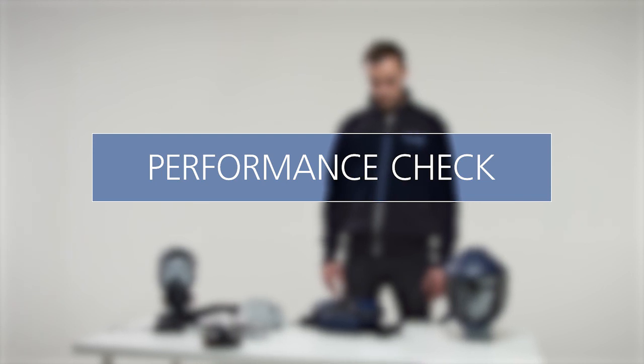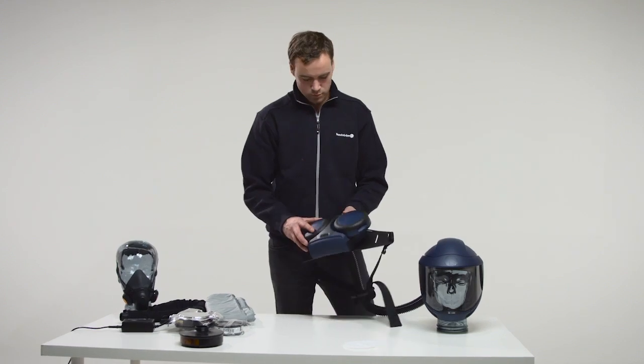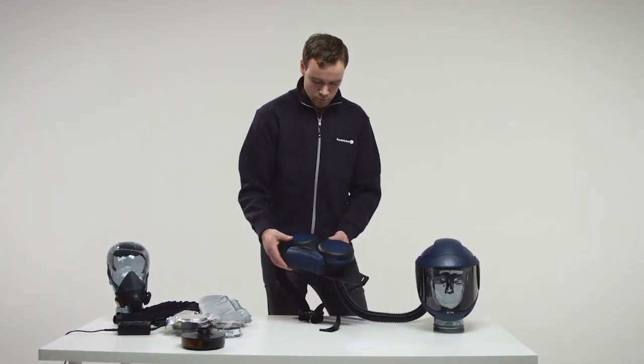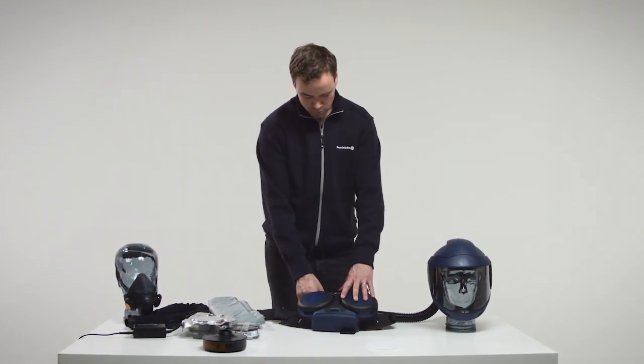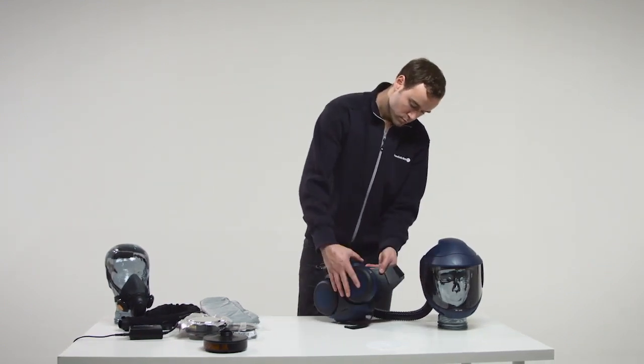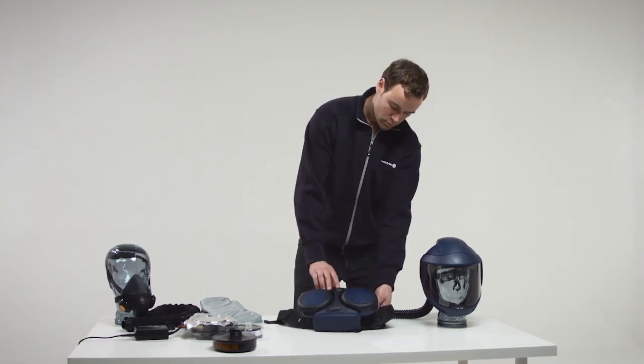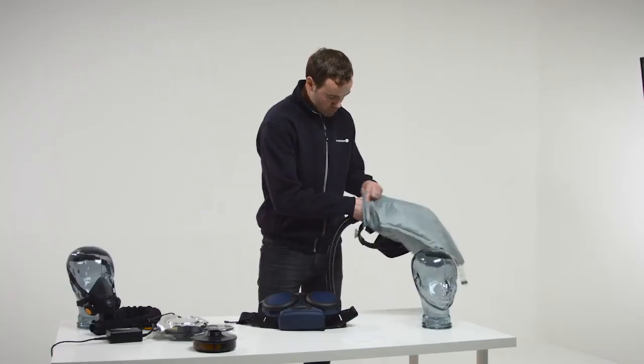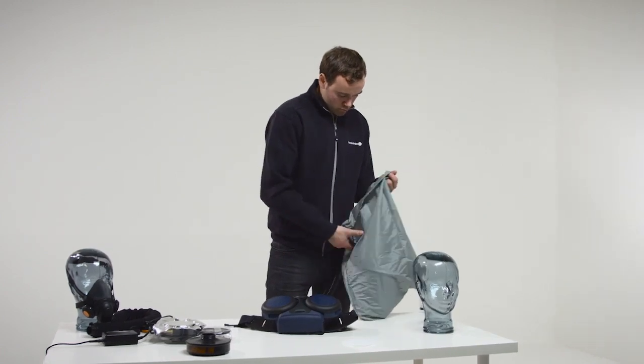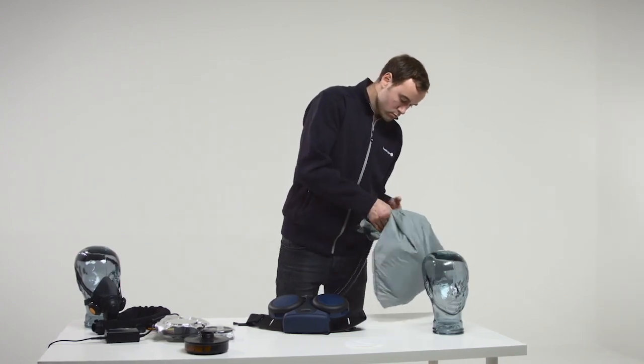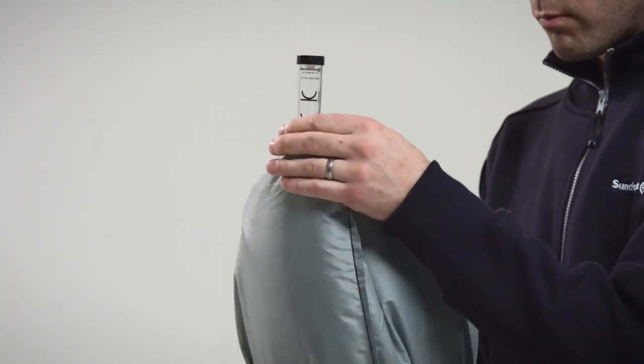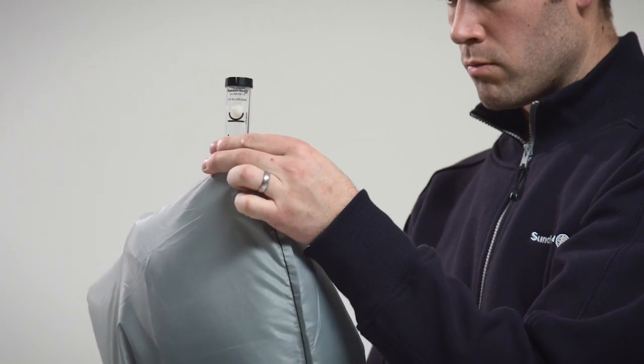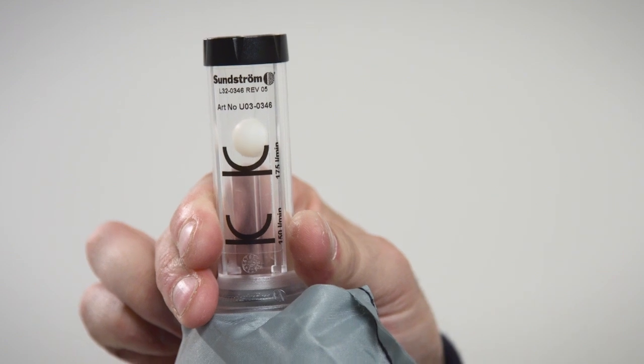Performance check. The performance check should be checked on every occasion before the fan is used. Check of the minimum flow. Check that the fan unit is complete, correctly mounted, thoroughly cleaned and undamaged. Start the fan unit. Place the head top in the flow meter. Grip the lower part of the bag to seal around the breathing hose. Grip the flow meter tube with the other hand so that the tube points vertically upwards from the bag. Read the position of the ball in the tube. This should hover at a level width or slightly above the upper marking of the tube, 175 liters per minute.